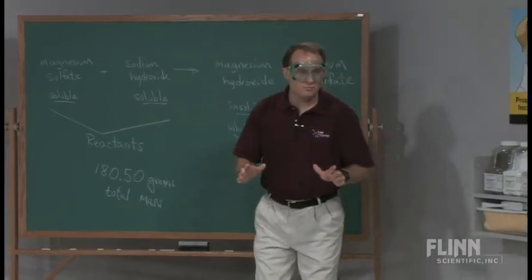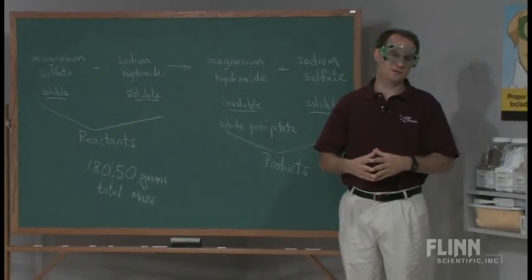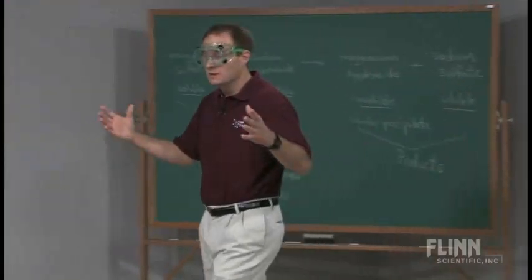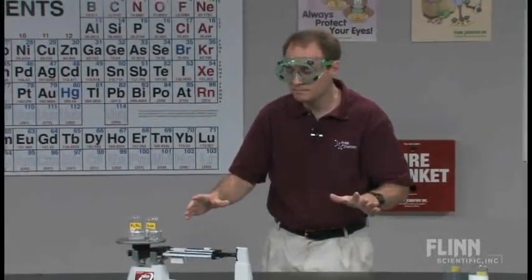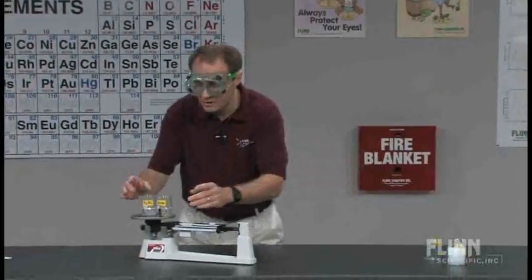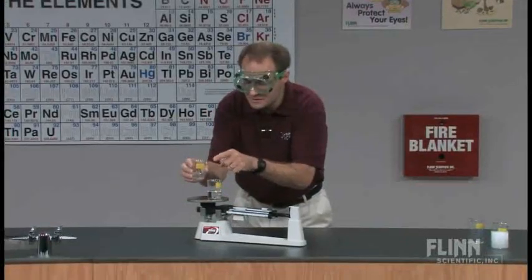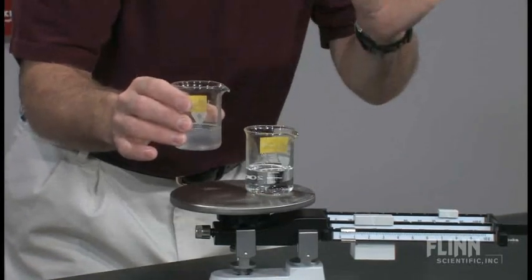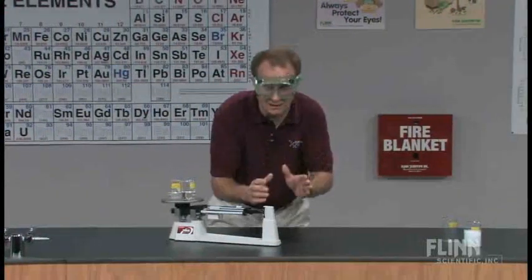If we stop for a moment and ask our students to make some predictions, there are three possible outcomes. Does the mass go up? Does the mass go down? Or does the mass remain the same? Again, to make sure we're very clear, I'm going to tell them, when I pour this into the other beaker, what's going to happen to the total mass? I know I'm producing a white solid.